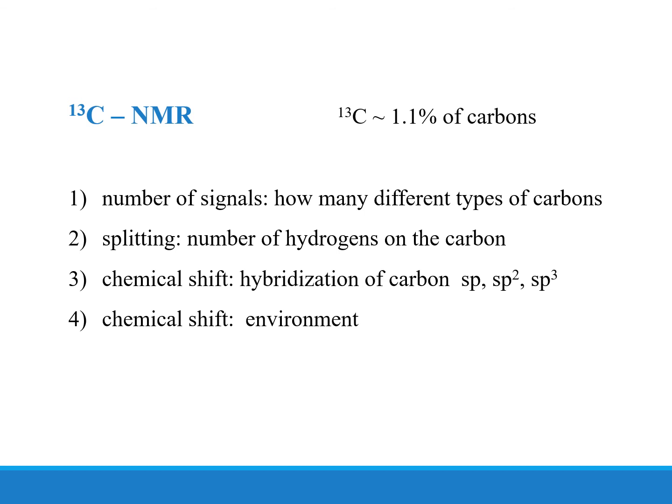And chemical shifts differ based on, again, the electron density around the carbon atom, and the nearer the carbon atom is to electronegative groups, the more deshielded it will appear in the NMR spectrum. Simply, the chemical shift is a measure of the environment of that carbon atom, how that carbon is bonded to the neighboring carbon atoms.